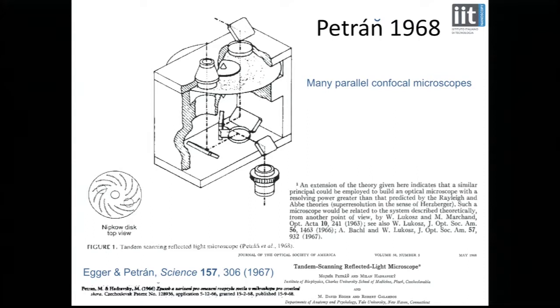Now I'm going to jump to a bit later than Minsky, to some papers by Petran, from Czechoslovakia. I met him, I saw him just last year, so he's still active, although he's older even than me. Anyway, so this is his system.